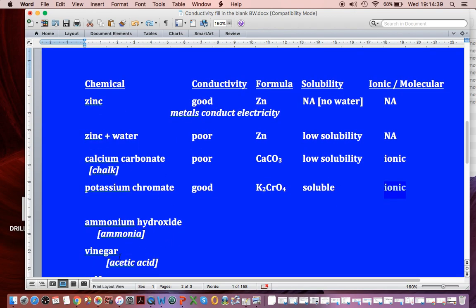Ammonium hydroxide, which we often call ammonia in this case. So we look at it. And it was weak. It was a weak conductor, but it wasn't poor. We could see the lights of the bulbs up here.